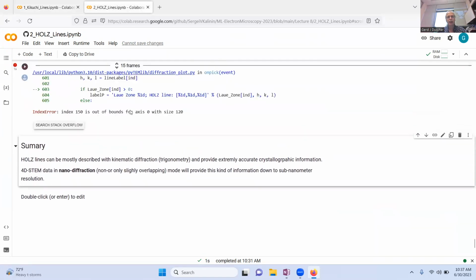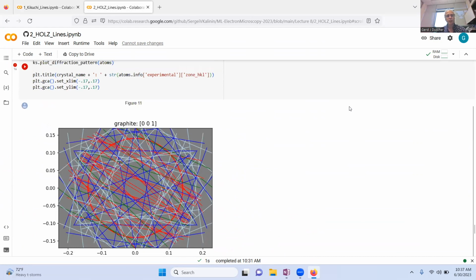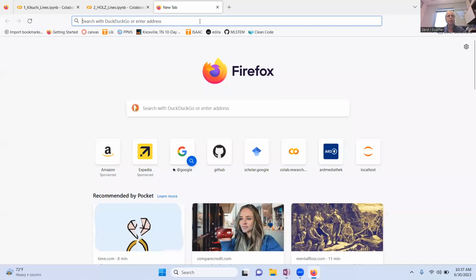So the Hough space is your friend here. And you can compare that directly with your experimental images. So nothing really has to be done very strenuously here, or mathematically involved. So huge amounts of data can be generated in no time.